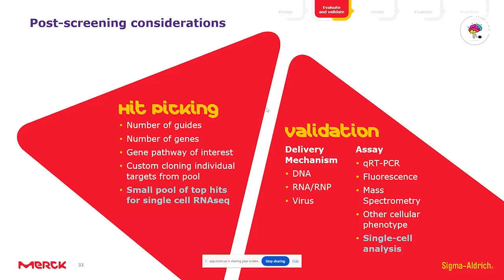And for the validation, of course, the delivery mechanism, so DNA, RNA, or RNP, a virus, and there are the assays that can be used for validation, like real-time reverse transcription PCR, fluorescence, mass spec, or, sorry, single cell analysis.